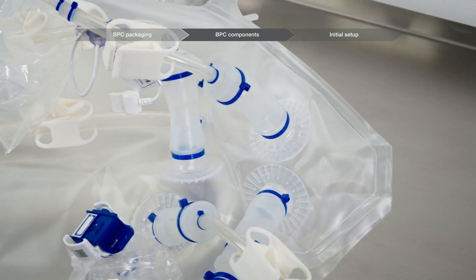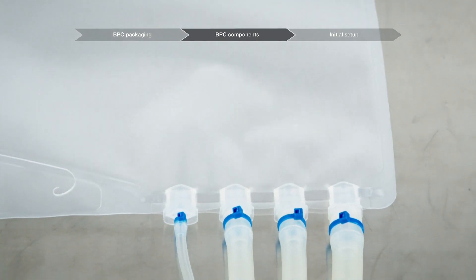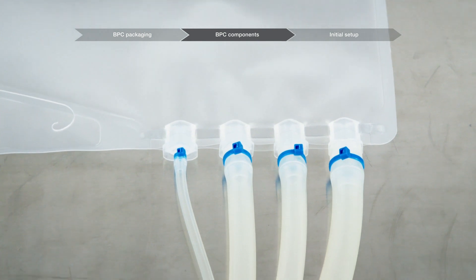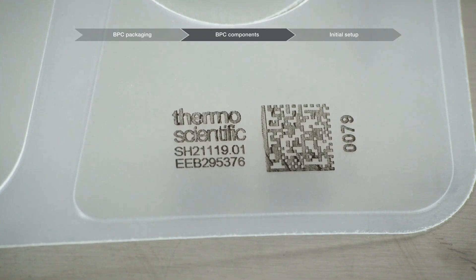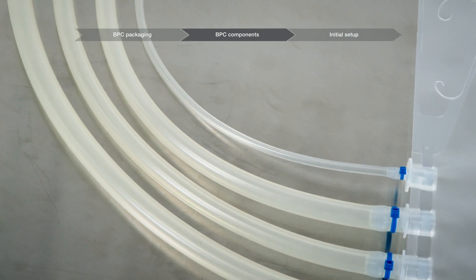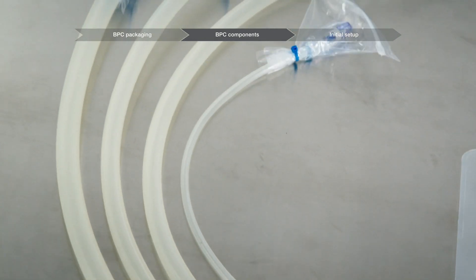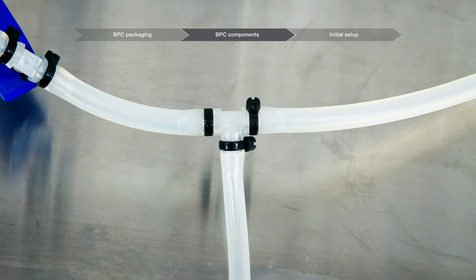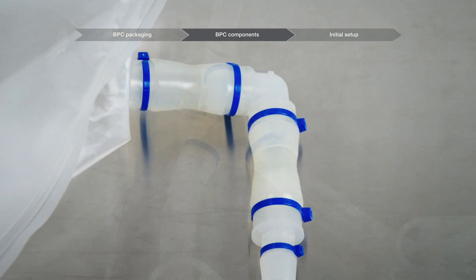Ports are the points where the line sets connect to the chamber. They are sealed into the film during the manufacturing of the chamber. The chamber lot number consists of the ports and the film used to create the chamber. Tubing is a flexible component that allows for the transfer of liquid from one location to another; tubing materials and sizes vary greatly. Fittings are the T, Y, and X straight or elbow components that allow a line set to change tubing sizes, allow for manifolding, or direct a flow path.